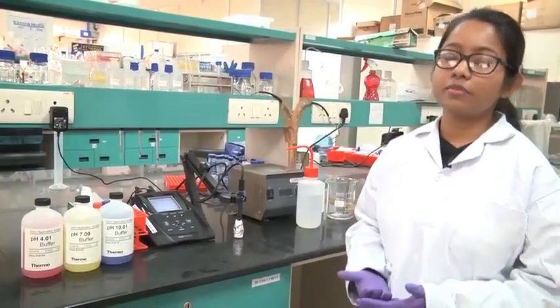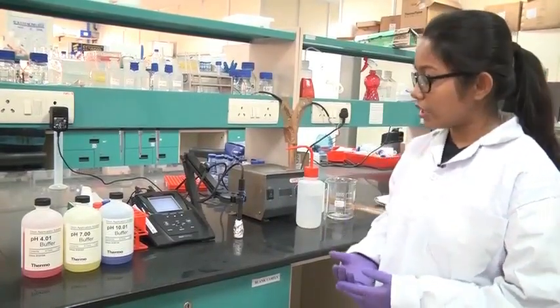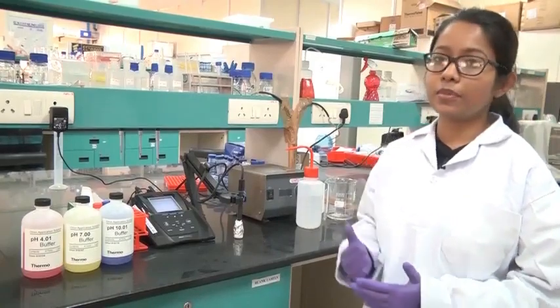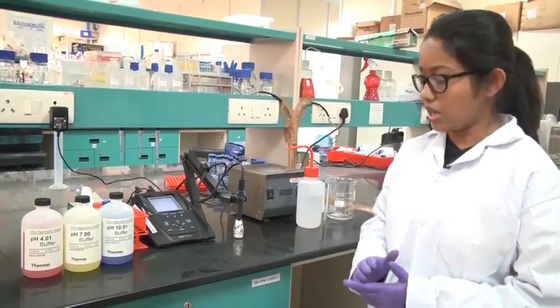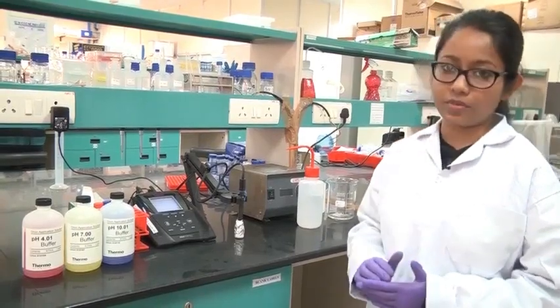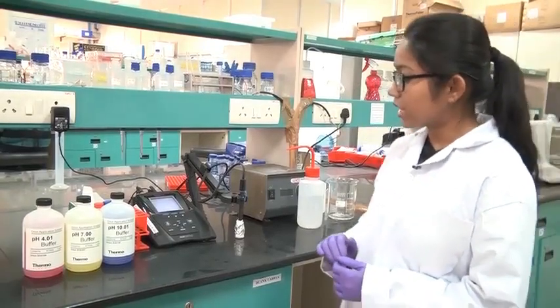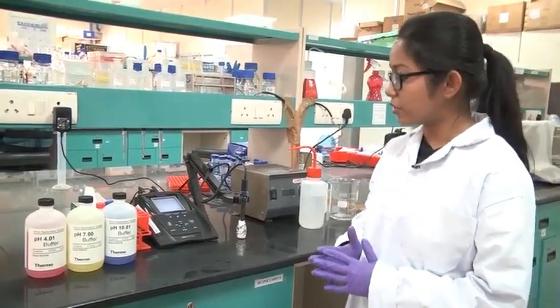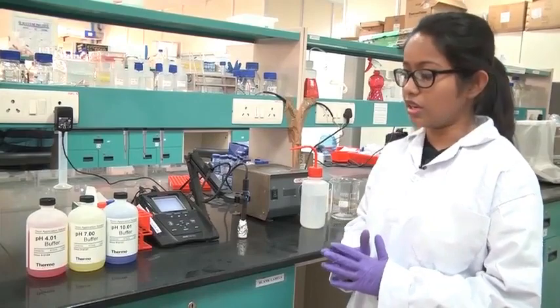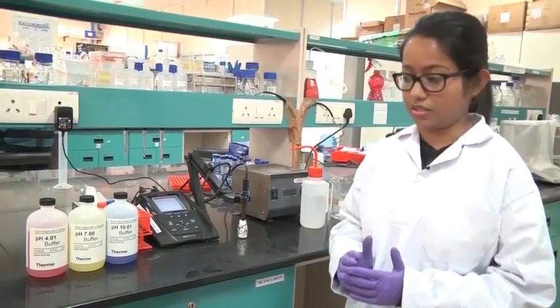Now, before we start measuring the pH of a particular solution or experiment, you should always know if the pH meter is properly calibrated or not. At regular intervals, all instruments should be cleaned and calibrated, otherwise accurate pH will not be shown. So right now I will be showing how to calibrate your pH meter using 3 different solutions, and this is known as the 3-point calibration method.